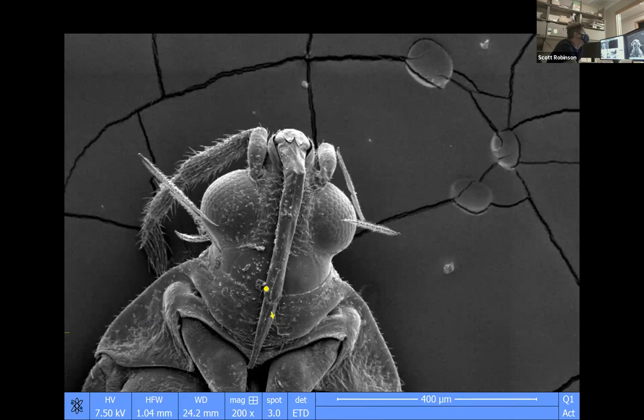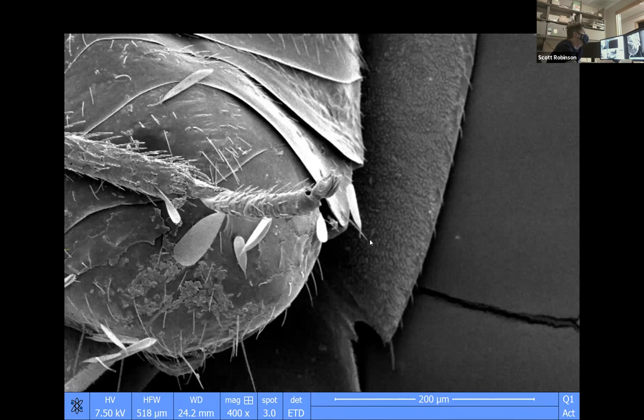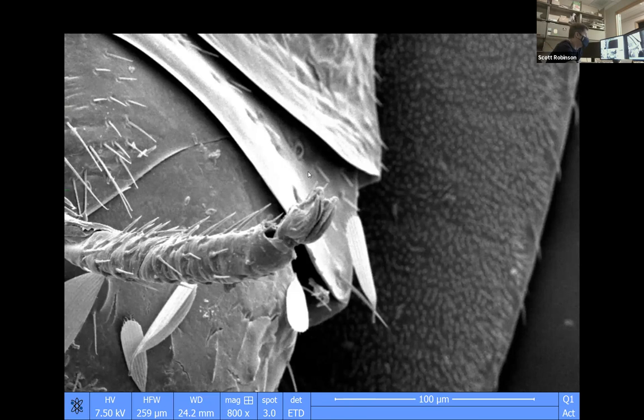See where its legs are broken off. You can see one of its legs. You can see some butterfly scales. You can see one of its feet right here.